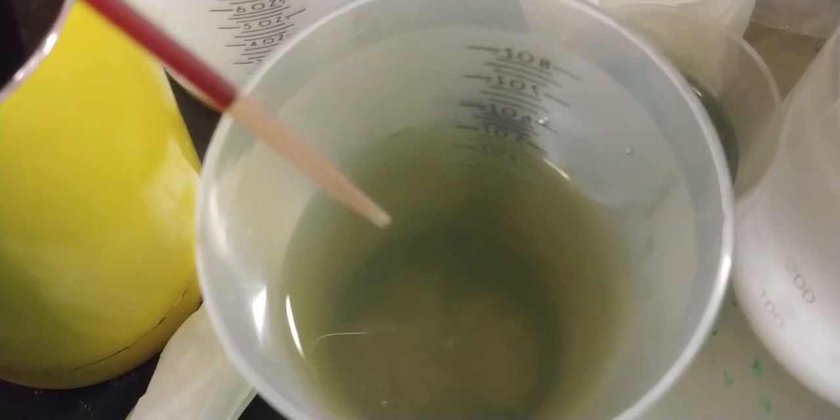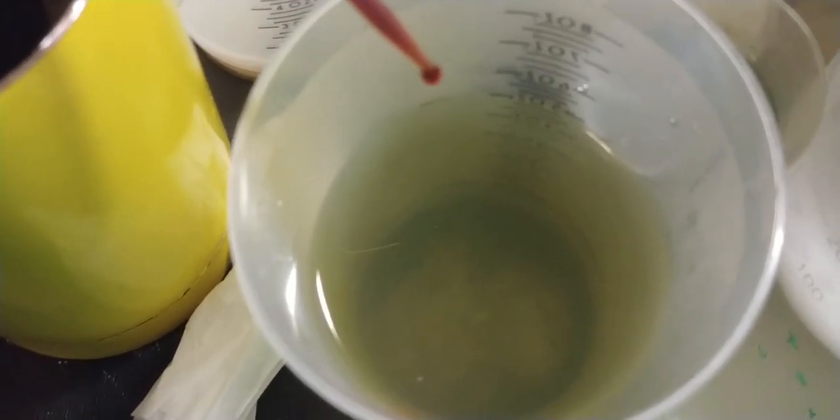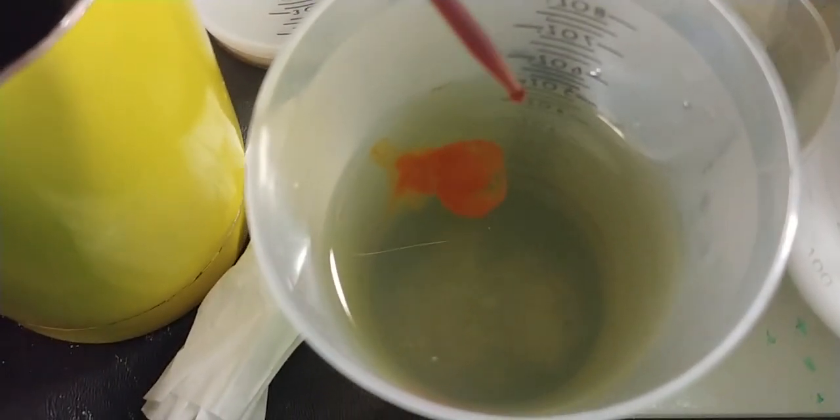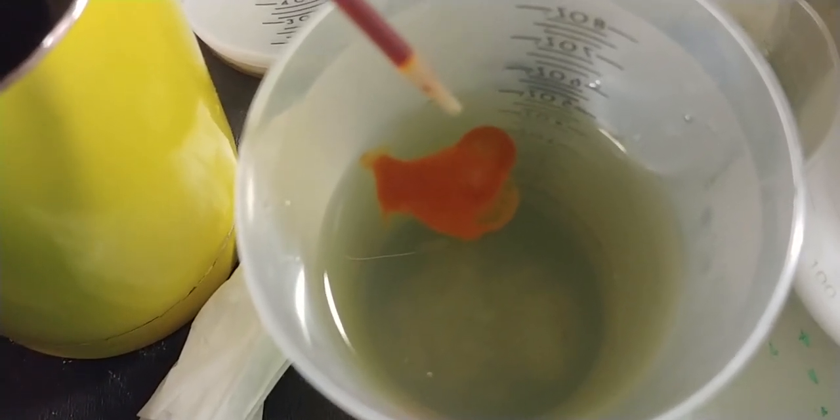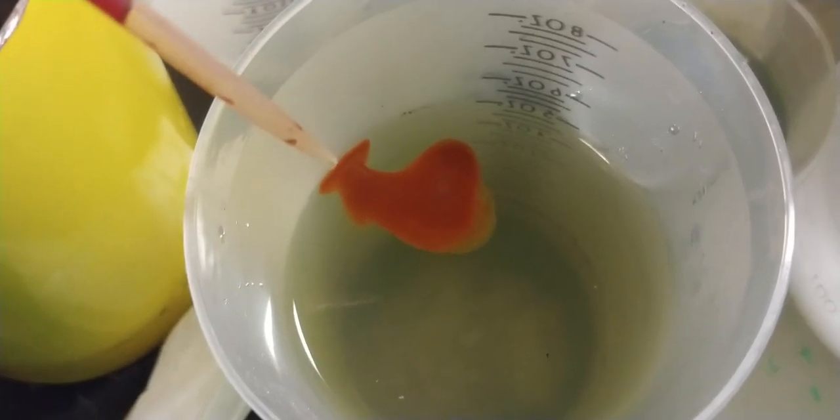This is a test for thallium using potassium iodide. I'm adding it to the solution, and instantly it forms a precipitate, so there could be thallium in there, but I'm not sure.